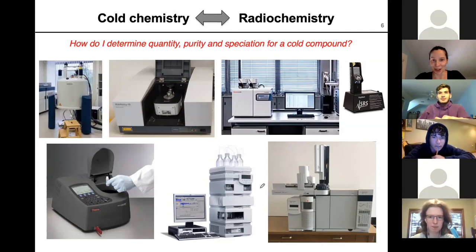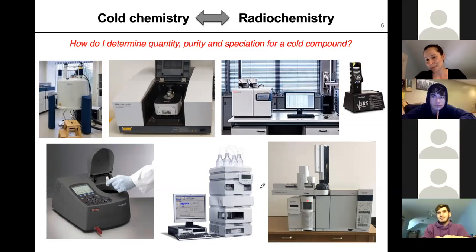The one in the center on the bottom? The HPLC. HPLC, yes. So what's the main readout on the HPLC typically? It can be absorbance. Absorbance, exactly. So what are some of the concentration ranges that could be appropriate to detect absorbance? It can be micro to regular molarity. Yeah, that's a good guess. I would say depending on the compound, you could go even lower. So this may be a slightly more sensitive technique. Are we getting into the range of radiochemistry?